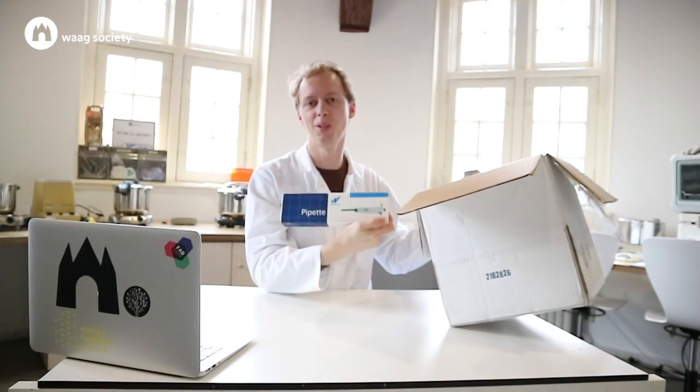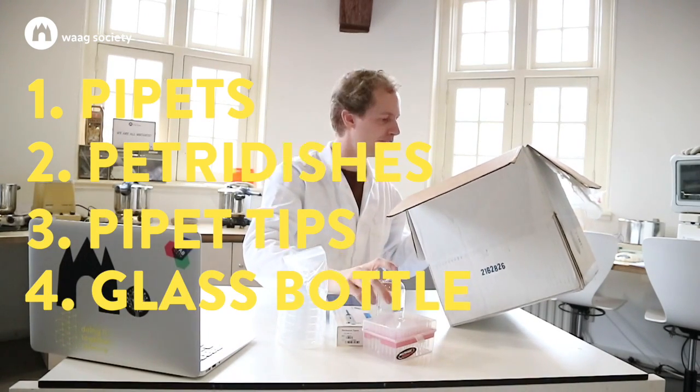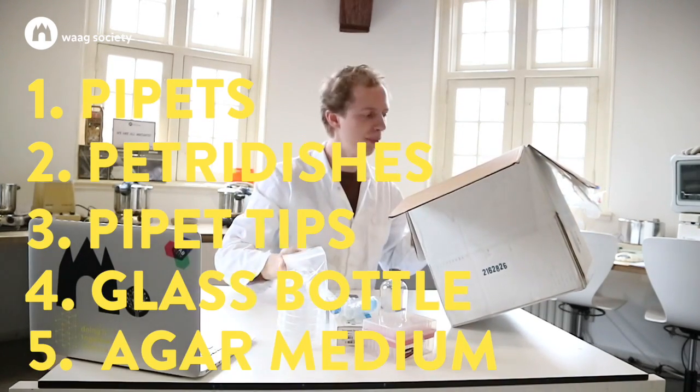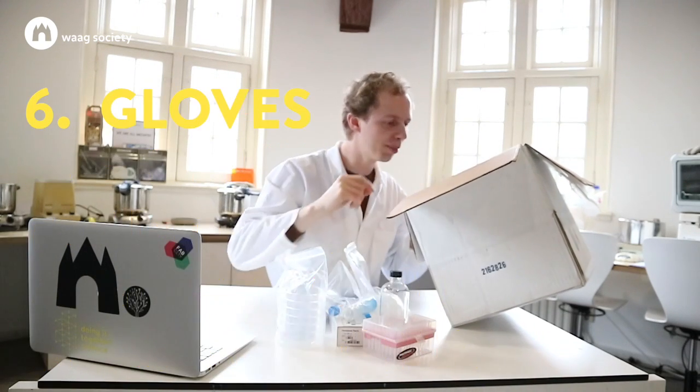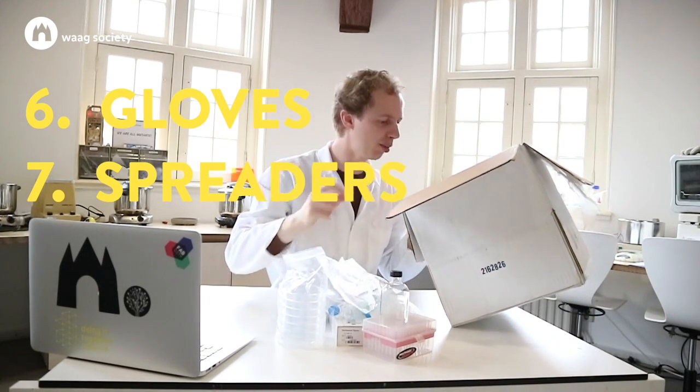Of course to do genetic engineering you need a pipette, petri dishes, pipette tips, a bottle — I guess that's for oilings and stuff — agar medium, gloves, small tubes, spreaders and inoculation loops.